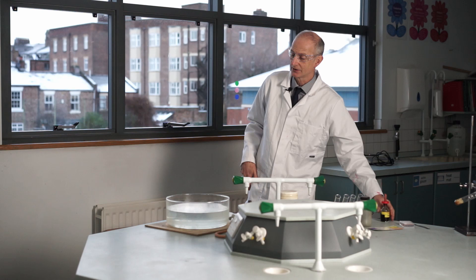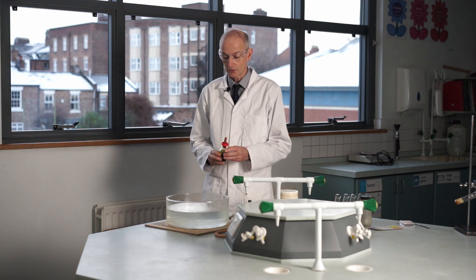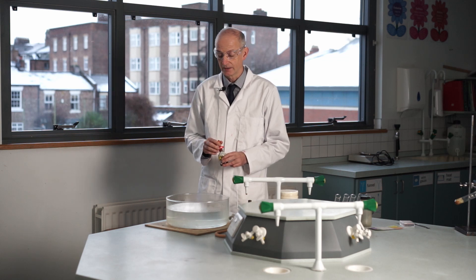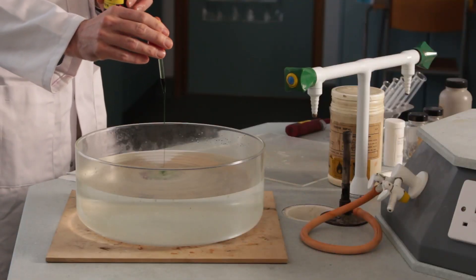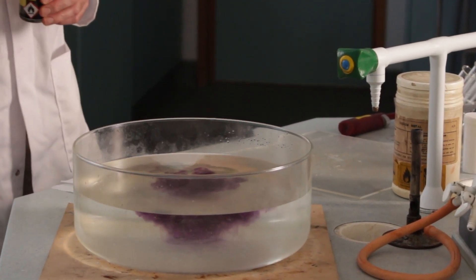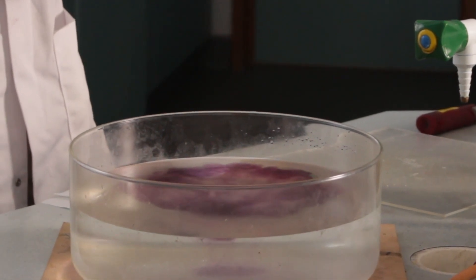What I'm going to do is add a little bit of indicator — universal indicator solution. If the water is neutral it should stay green, if it's become acidic it'll go orange or red, and if it's become alkaline it'll go blue or even purple. It's going very dark blue — almost purple. So it's obviously a very strongly alkaline solution that's been formed as one of the products of this reaction of sodium with water.